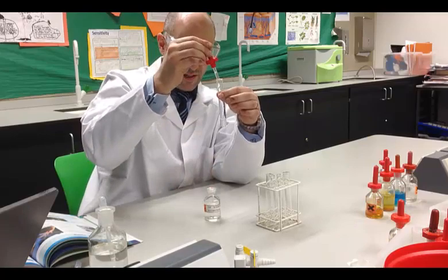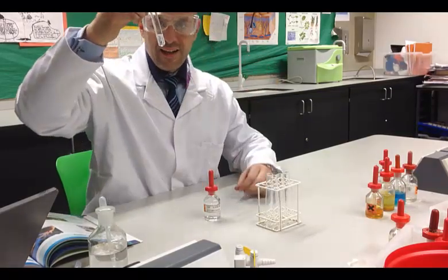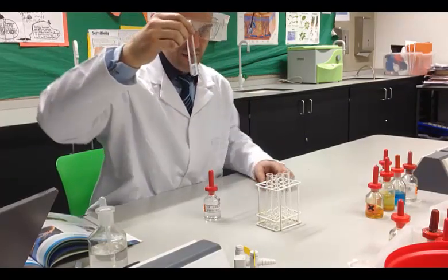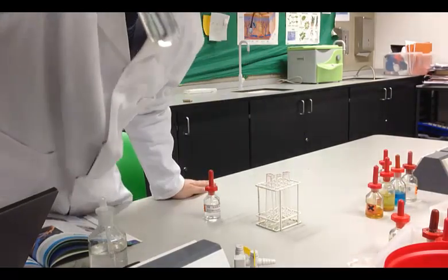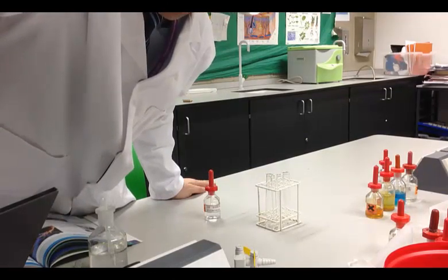It's hard to see this, so I'm going to add a bit more. The precipitate isn't as clear as with the others, but if you look carefully, there's some cloudiness going on here. Right, that is the aluminium precipitate.